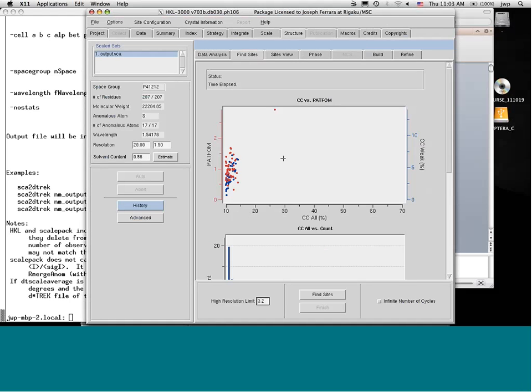You can let this run a lot longer. I know in the CCP4 interface, I think it's 200 tries or 300 tries, and so on. But you've got to have reasonably good data to do sulfur SAD. If you have 2.8, it might be tougher. Although I'll stop there.